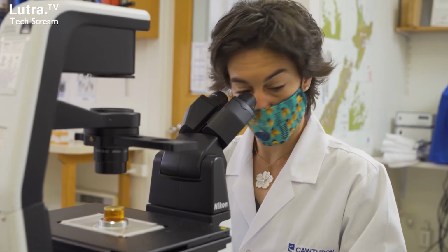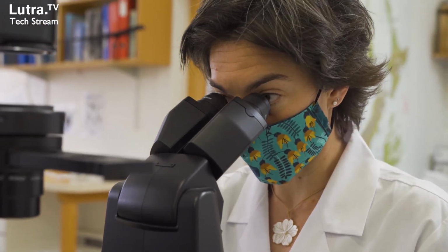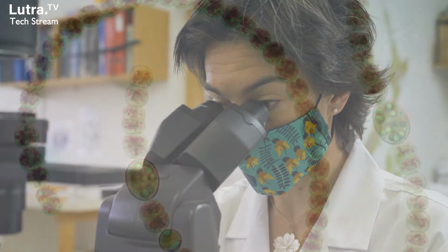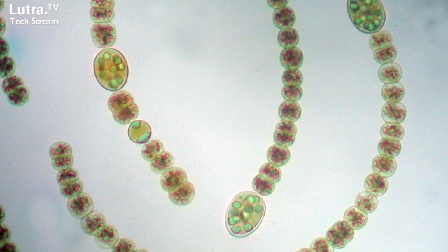So once the samples arrive at the lab, we analyze them by microscopy. We literally look at them, and with that we are able to see and identify, but also count the cells in the sample, and that gives us an understanding of what's in there and in what abundance as well. Oh, so it can be done quite quickly then, from taking the sample to identifying the risk.